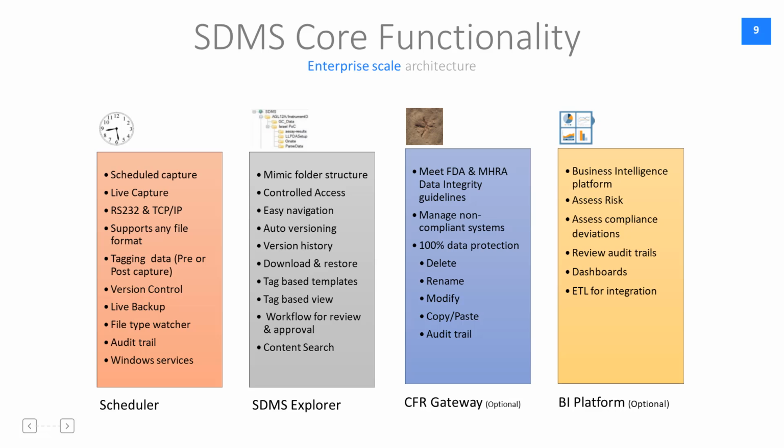Schedulers can be configured with respect to time, as well as there is a live capture module available as and when data is being generated and not being used by any other software. LogiLab SDMS scheduler will capture the data and send it to the server automatically.